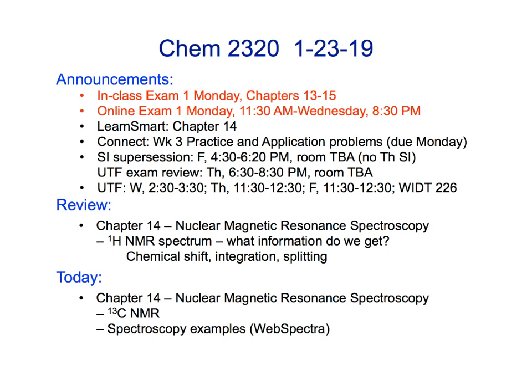What we want to do today is talk about C13 NMR. So we're going to go through a little bit about C13 NMR, what it tells us, look at some examples of that, and then we're going to start working some examples. We're going to work a few of the examples that I put in the notes, and then we're going to go to this website called Web Spectra, and we're going to work some examples there.